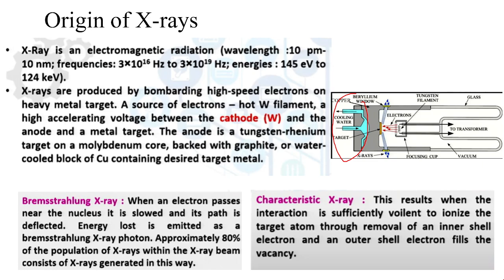As we know, because of that electron release, a positive charge must be generated, and that's how it is ionized, and that electron removal must take place from the inner shell, and that's why you need very high energy radiation.